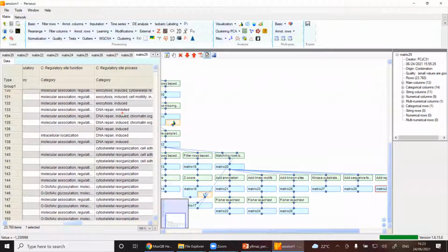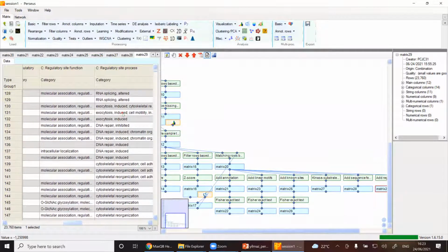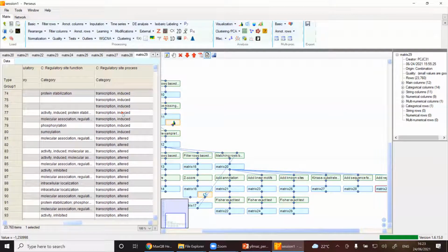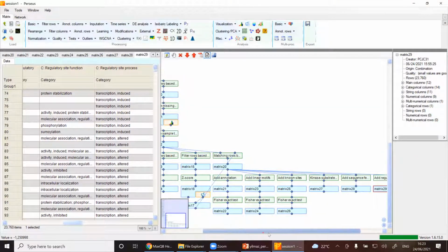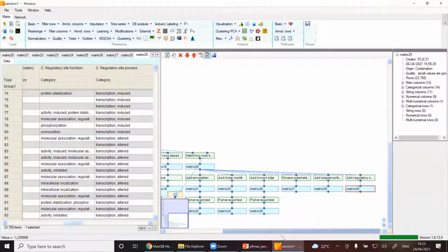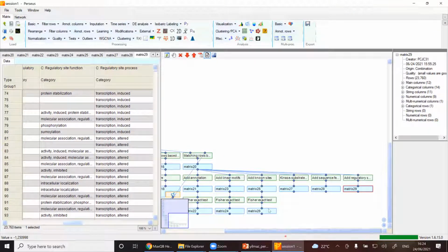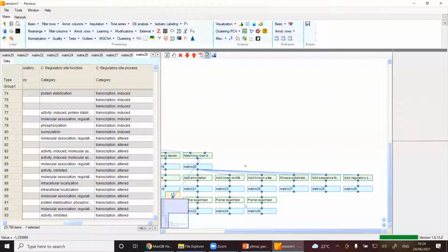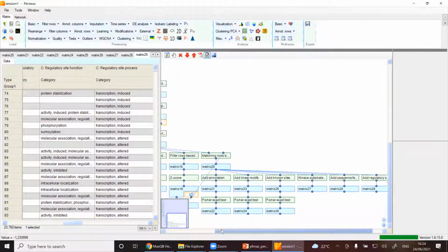Cell growth. Okay. So yeah. Regulatory. Okay, so what you can do, you could check these subclasses further, and then you could do a Fisher exact test based on what you were enriching for, and then you will get a bit more information about your PSP.